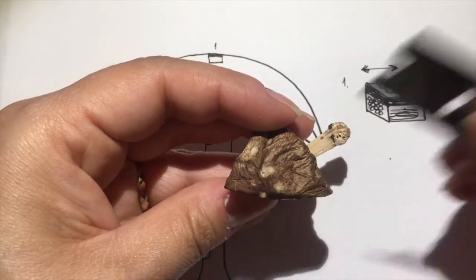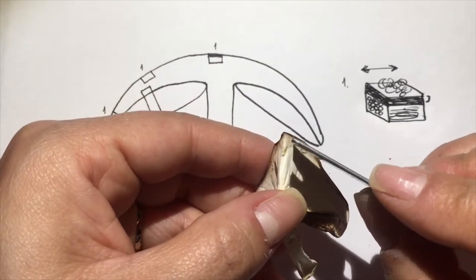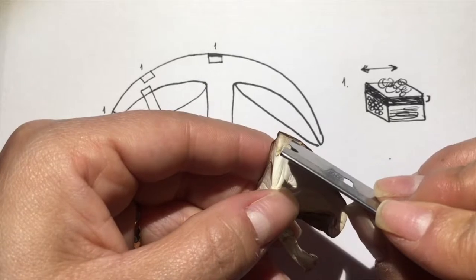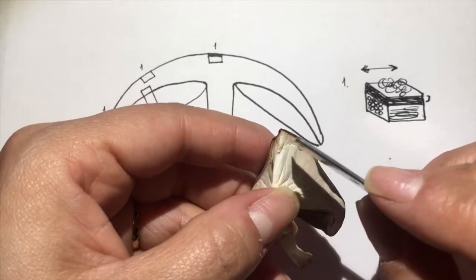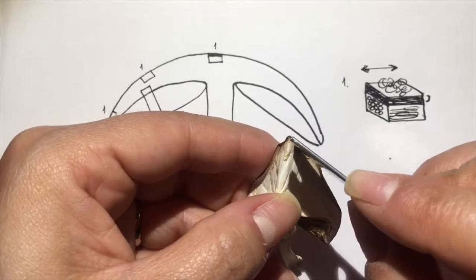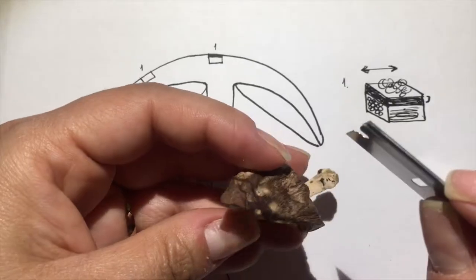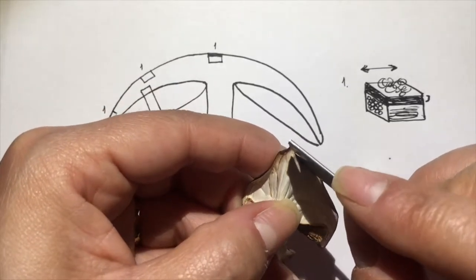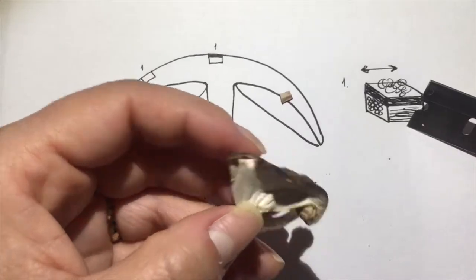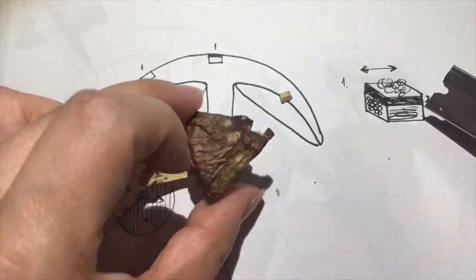It's not perfect. All right. And here we're just going to cut around here. We don't need to go all the way down here. That's too much tissue to see in one section anyway. And there's our cut.